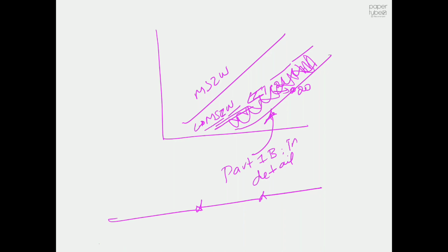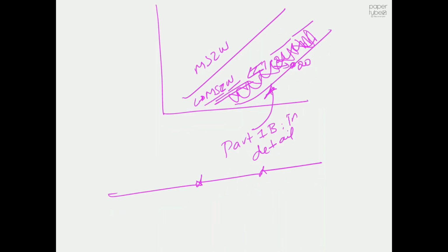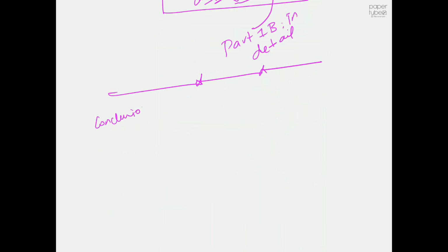Once you finish your graph and talk a bit about your results, make a decent conclusion. Something like: we performed a crystal growth experiment, we changed the seed loading, and we did everything else at the same conditions, like constant temperature, constant agitation speed, and the same initial supersaturation, and clearly seed loading made the whole kinetics a bit faster.